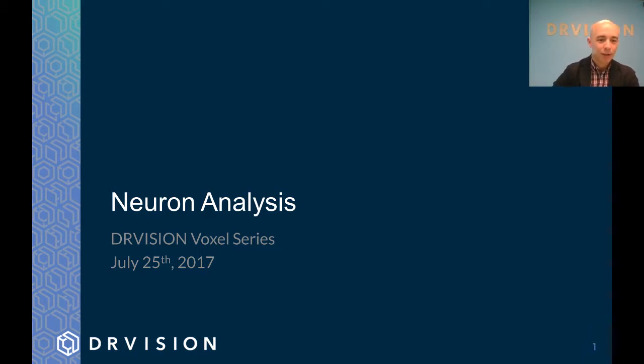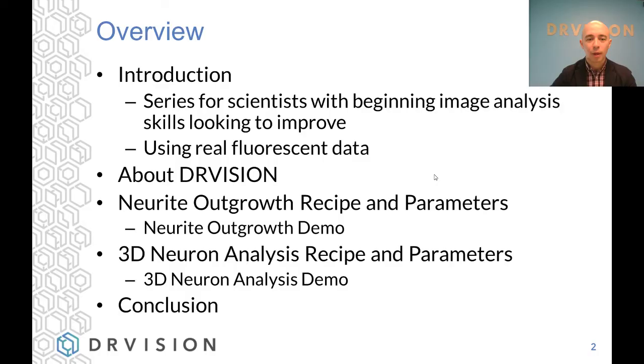Sorry about that little snafu there. We're back online. This is the third installment of our DR Vision Voxel webinar series, and today we're going to talk about neuron analysis. So we'll jump in with a brief introduction. Again, this is our series for scientists with beginning image analysis skills, or maybe even intermediate image analysis skills, who are looking to improve. And we're going to take a practical approach using real fluorescent microscopy data and some real applications that we've worked on here at DR Vision.